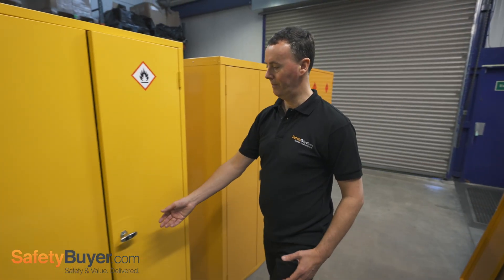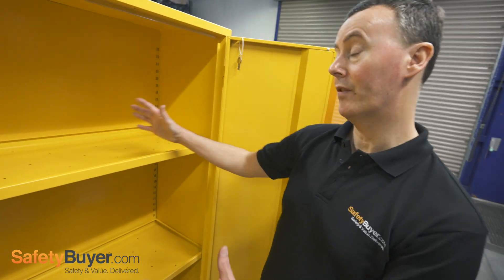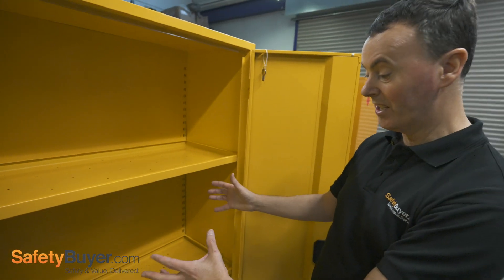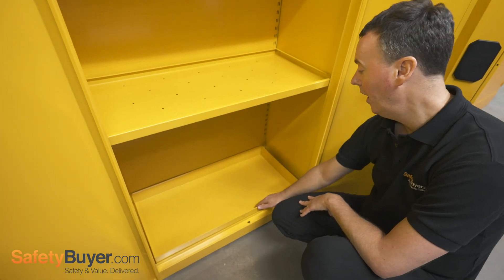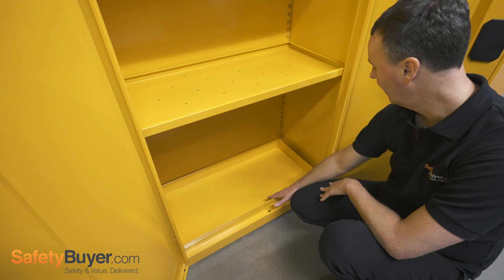So we'll start with this one first. The shelves in this cabinet are perforated and obviously designed so that any spill will work its way through the cabinet, potentially contaminating other materials, but will safely land into this sump tray in the bottom of the cabinet. This has a 27 litre capacity.